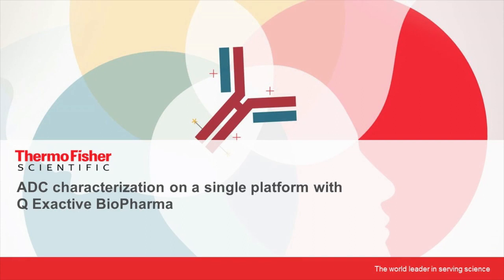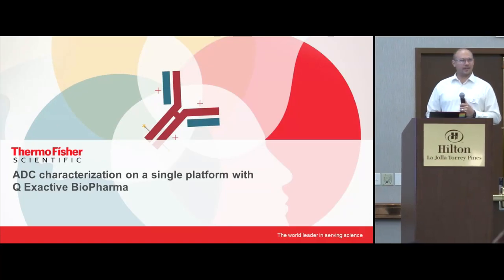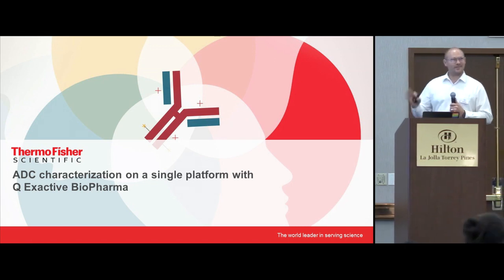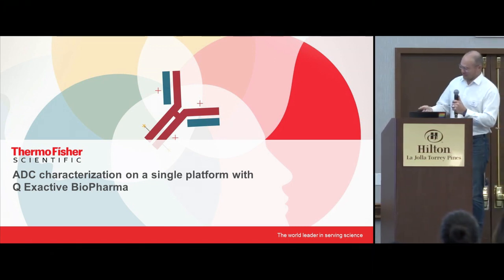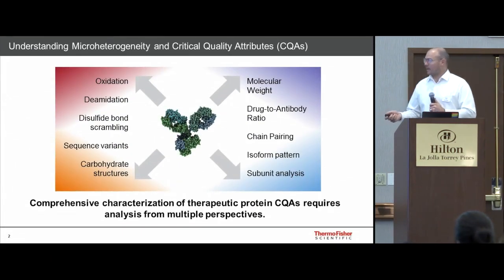So today I'm going to talk to you about ADC characterization on a single platform. This is with an instrument that we're calling Q Exactive BioPharma. So this is kind of a rather large jump from my proteomics days in the Yates lab, but if I didn't do that, I don't think I'd be doing this. So thank you, John. Anyway, so ADC characterization is quite complex.